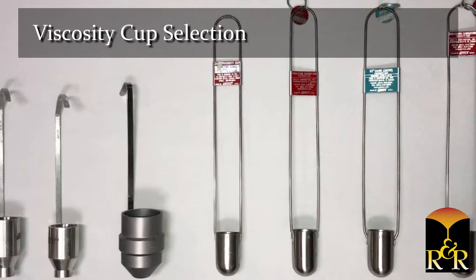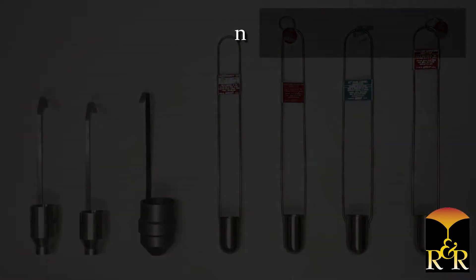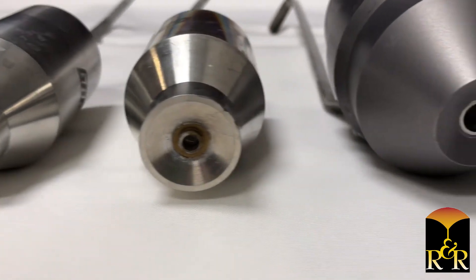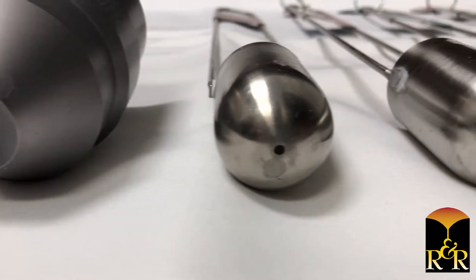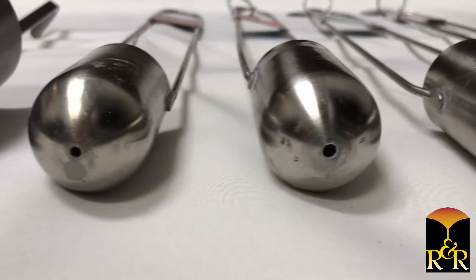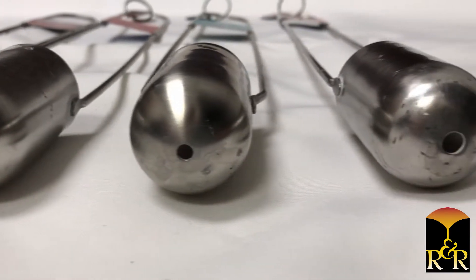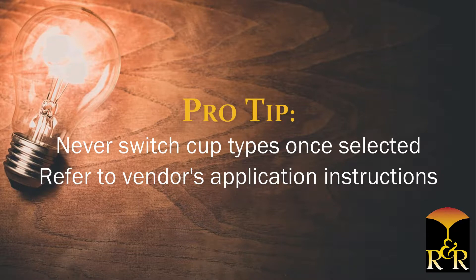Selecting the appropriate viscosity cup for your foundry is as equally important as testing viscosity itself. There are several types of viscosity cups on the market. The number of the cup is determined by the hole size in the bottom of the cup. For example, the higher the number, the larger the hole. Cups with a higher number are used for more viscous liquids. As each type and number of cup gives its own unique reading, it is important to never switch cups once one is selected.